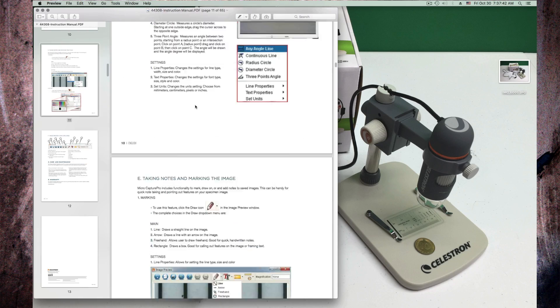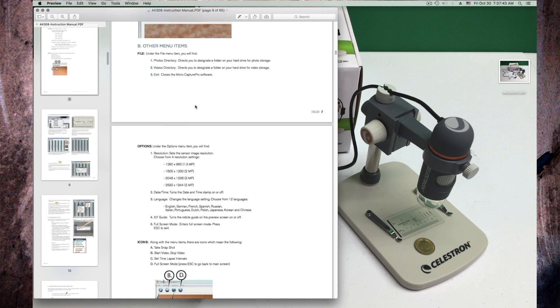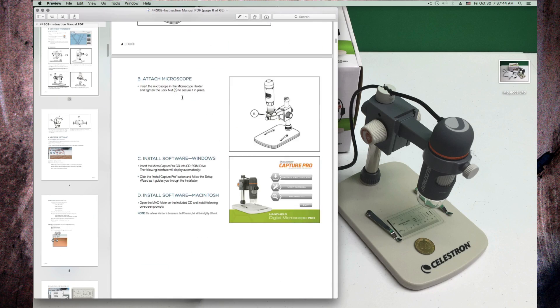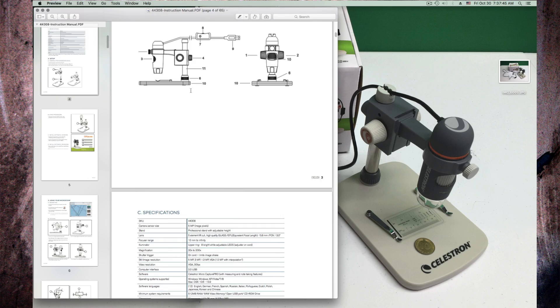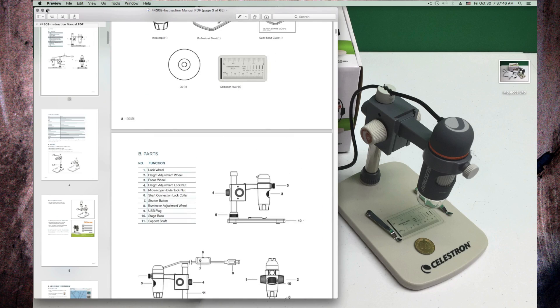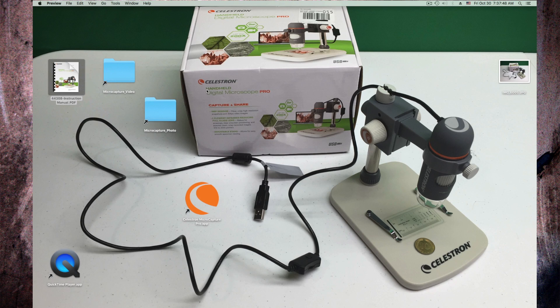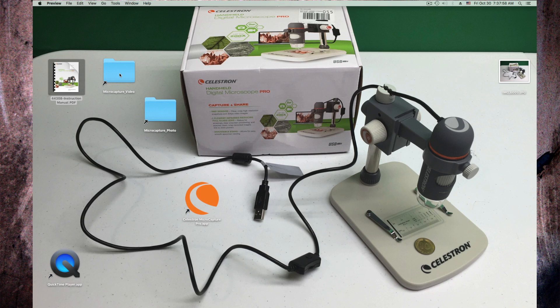I am using it here on the Mac. Setup and stuff is in here. The software that comes with it here for the Mac, this orange ball, is saving pictures in the photo folder and the video folder on the user's document folder.